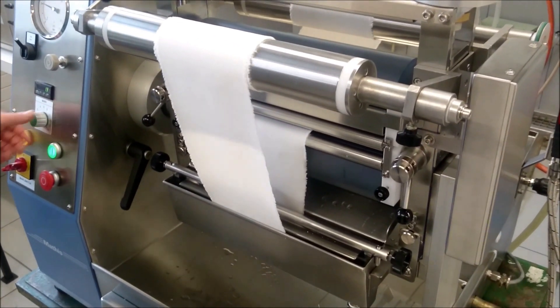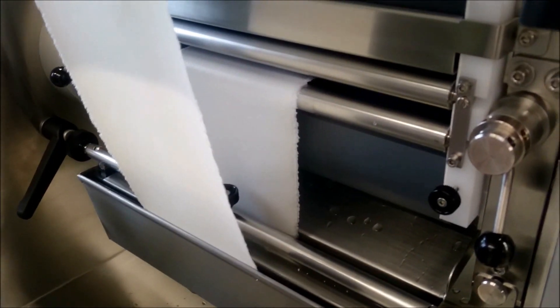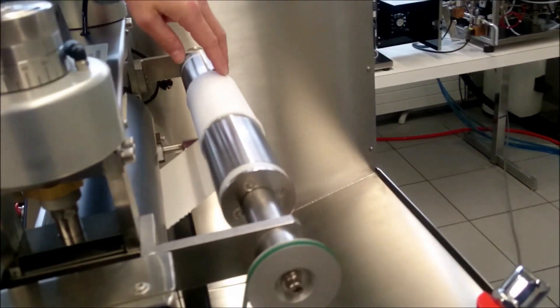Like this. The materials go through the trough, squeezing and winding on the back side.